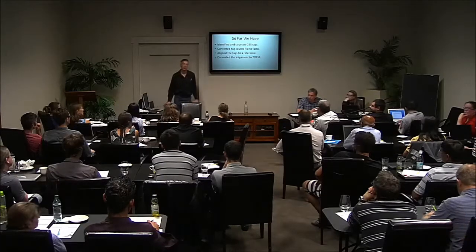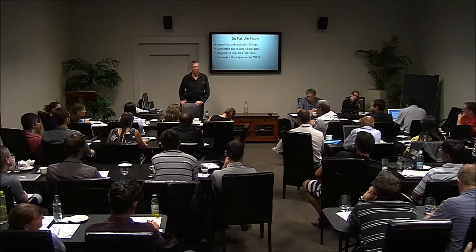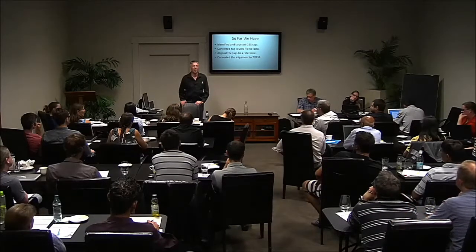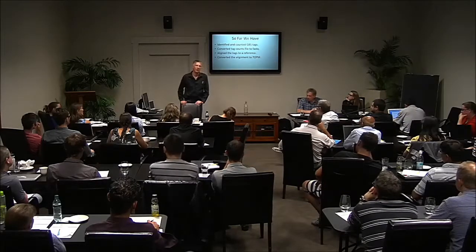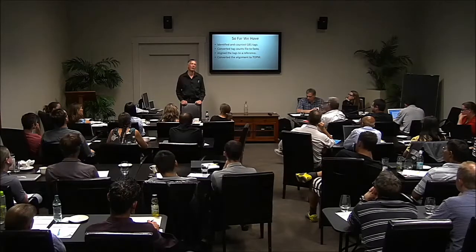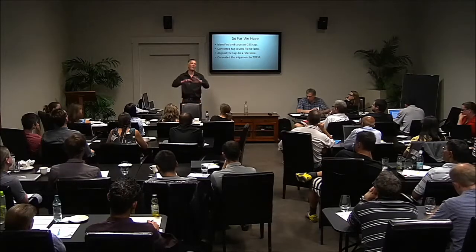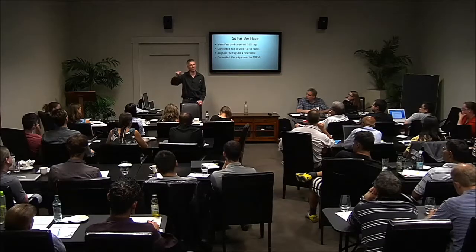John? Just double checking, at this stage you're only allowing one mismatch in those, we'll call it 64? Nope, thanks for bringing it up. The one mismatch thing would be the non-reference pipeline. We're not even thinking about mismatches here. We're just aligning to the genome.